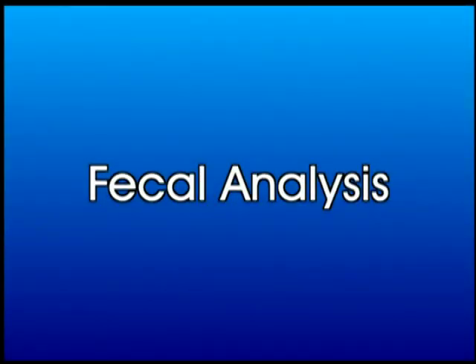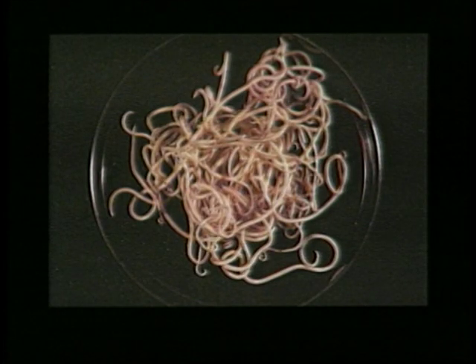The final laboratory skill we will discuss is the preparation and evaluation of the stool or feces. This is done to identify parasites that might be within the dog or cat's body. Because most parasites or worms attach to the intestines, the adult worms remain in the intestinal tract, shedding only eggs in the feces. For this reason, we must look for the eggs rather than the adult worms.